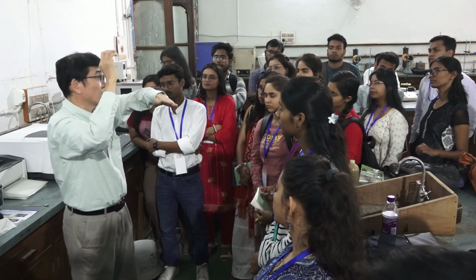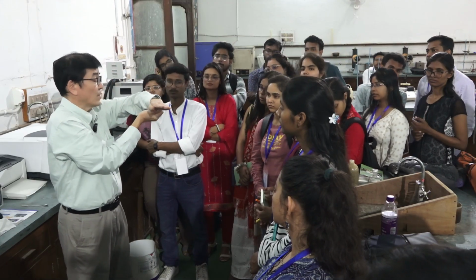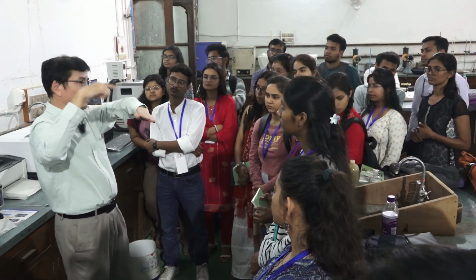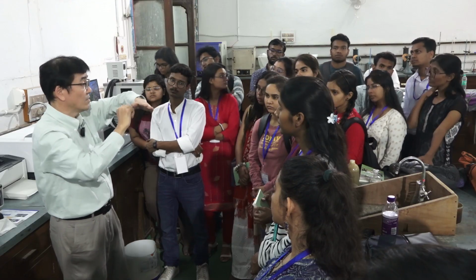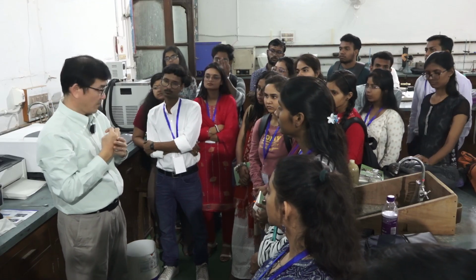By checking the absorbed energy, we can get the information of the IR absorption. So instead of propagating IR light, we use the evanescent wave. That is the principle of the ATR measurement.